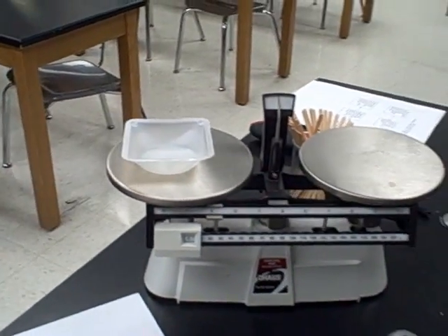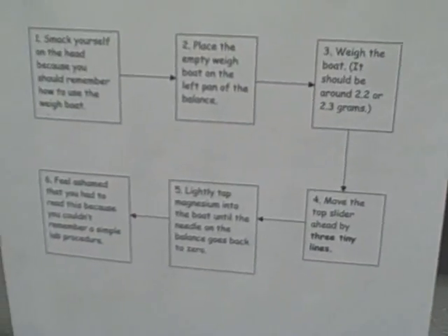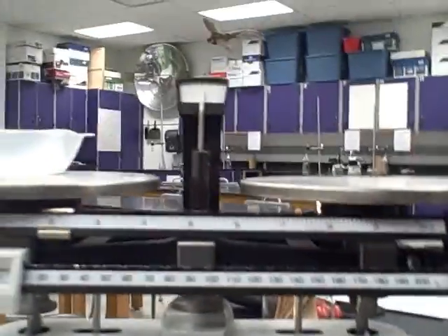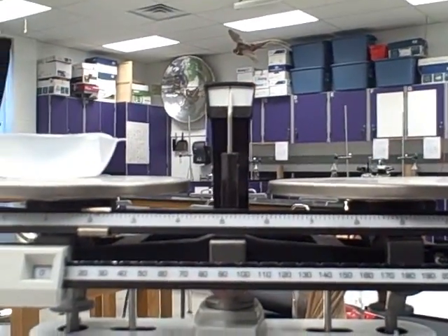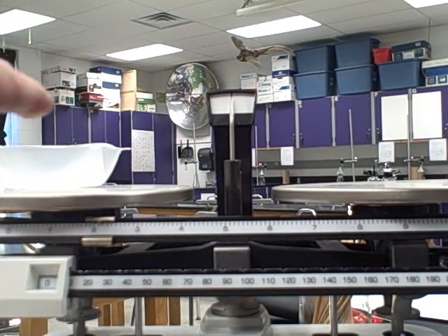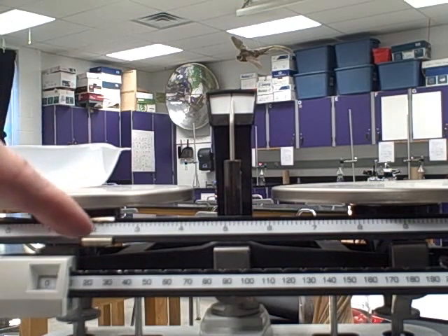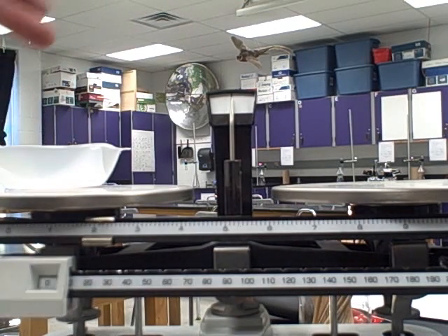In the first step, you need to measure up 0.3 grams of magnesium metal — that's three of the tiny lines on the scale. If you can't remember this, refer to the instructions on the cork strip. First, balance your scale with the weigh boat on the left-hand side. In this case it weighs 2.1 grams. We need 3 tenths of a gram — not 3 grams, 3 tenths.